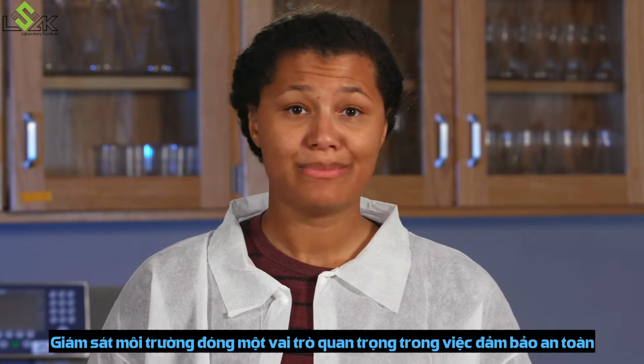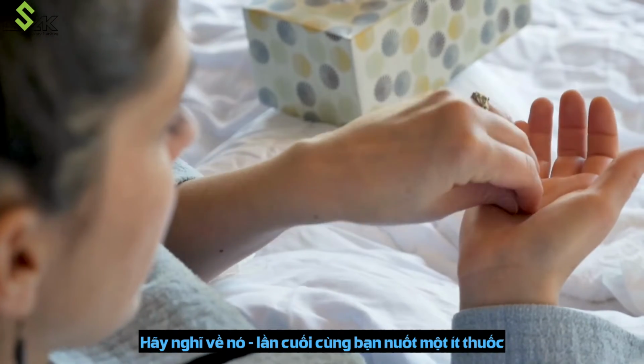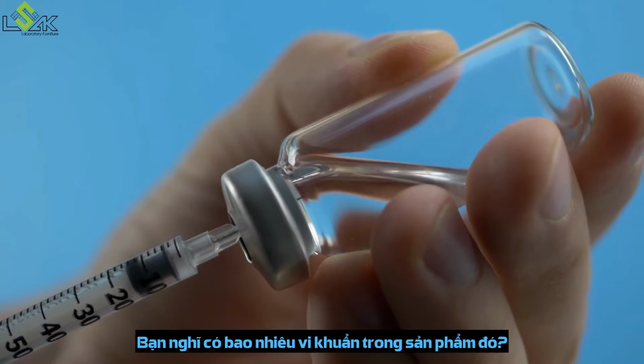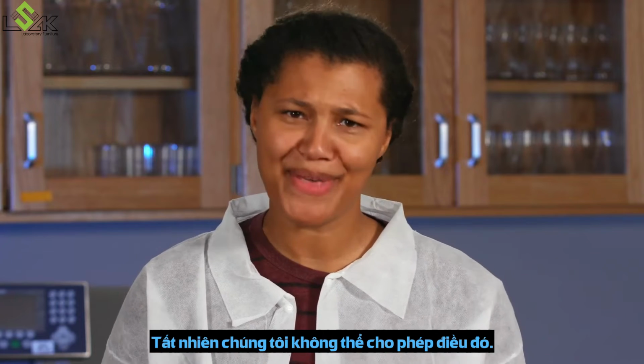Environmental monitoring plays a key role in ensuring our patients' safety and the efficacy of the products we make. Think about it. When was the last time you swallowed some medicine or got a vaccine injected in your arm? How many microbes do you think were in that product? 5, 10, 1,000? Of course, we can't allow that.